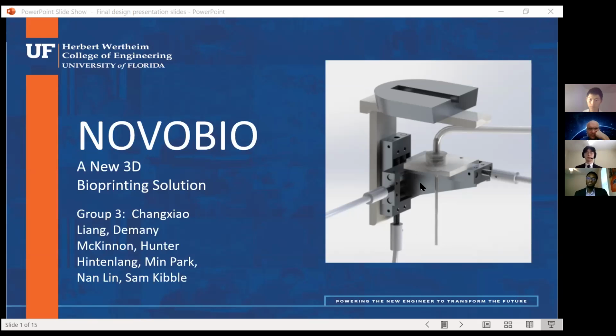Oh, it's due to the view angle. The printing head will be aligned with the optical axis of the microscope, and since the dispensing tip length can be adjusted by the customer, it will reach the well plate. The part which controls the linear motion stages has a connector at the bottom.